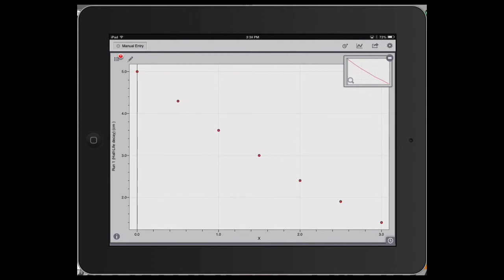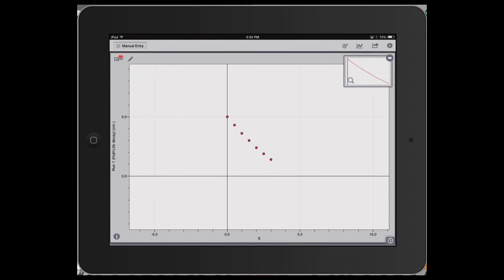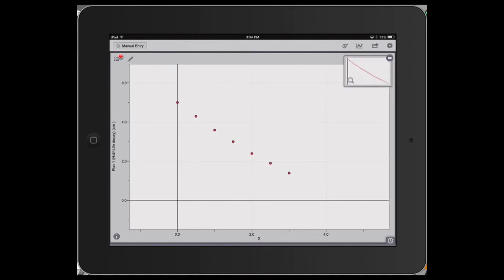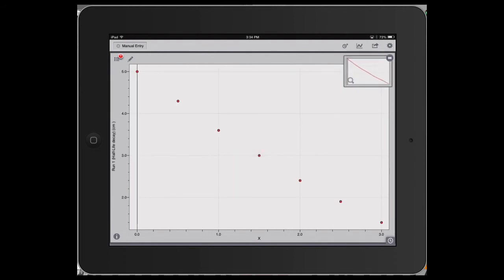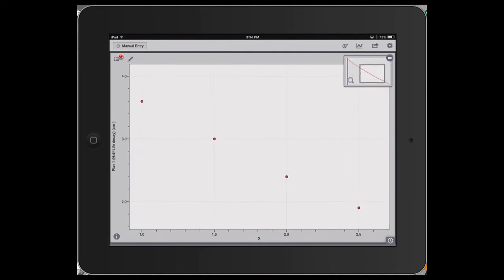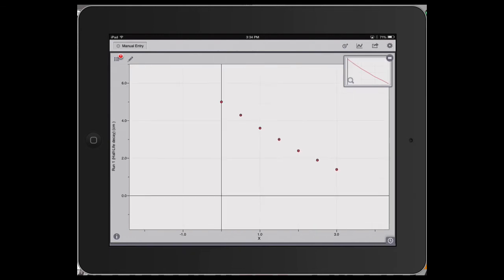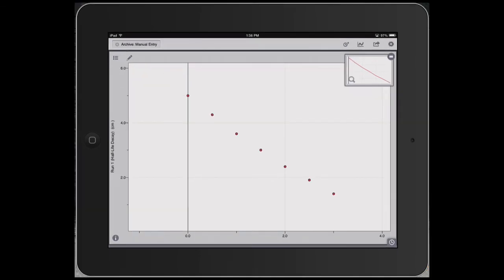If I want to zoom out, I can just pinch, and it'll zoom out for me, and it auto scales. If I double click on a point, it will auto scale to all of the points that are there, and I can also expand my 2 fingers from a pinching motion to zoom in and zoom out. Okay, we're going to continue on and look at a few other features.